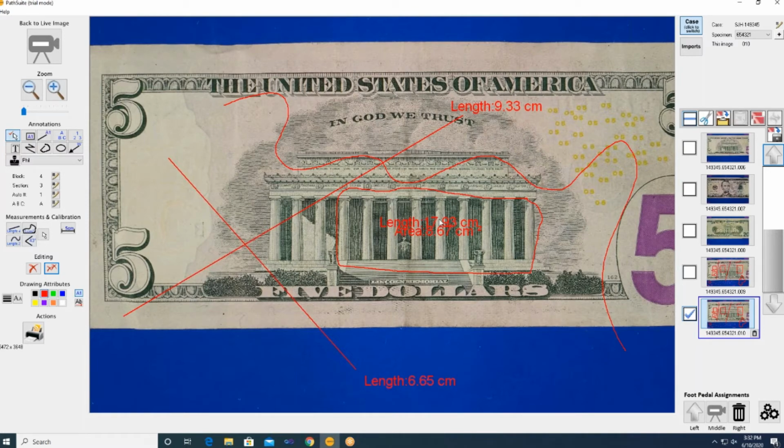It's in the measurement, you have to choose it. Oh, yep, you're right. Okay, so that's how we can do measurements. We can add basically a calibration mark down in the corner. It'll drop that in. And all of these have the ability to have their colors changed, their line thickness changed, and the size of the font actually edited.